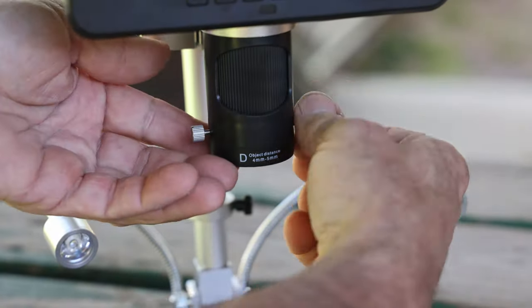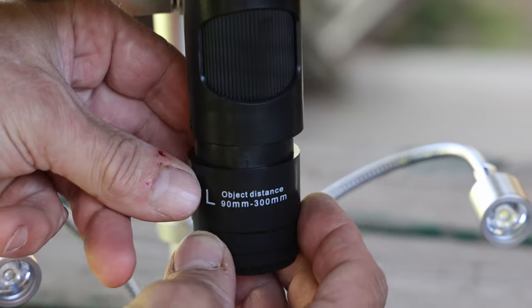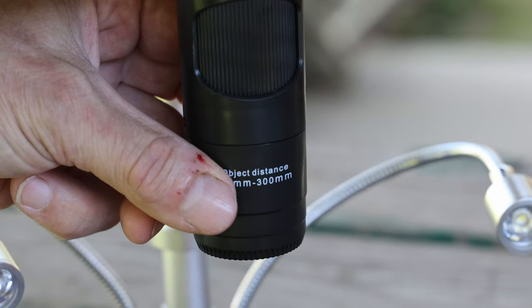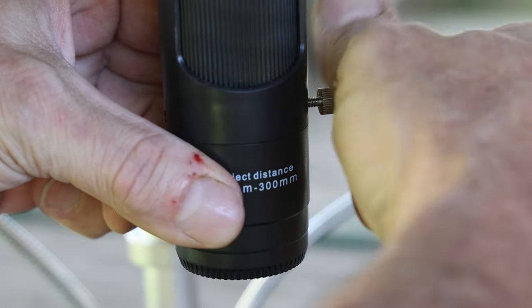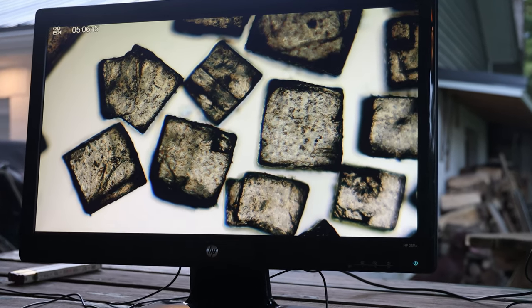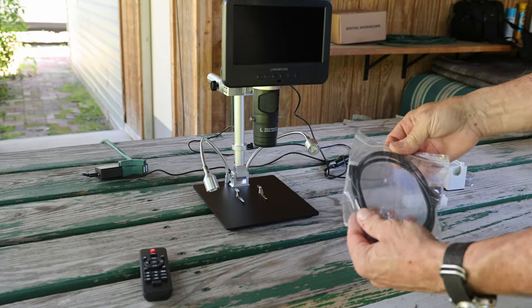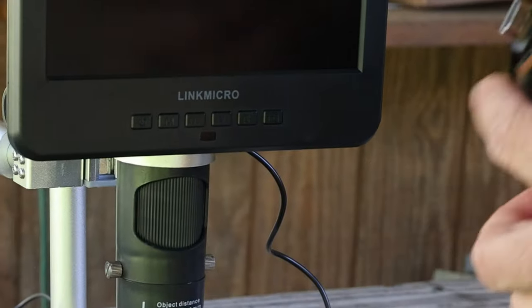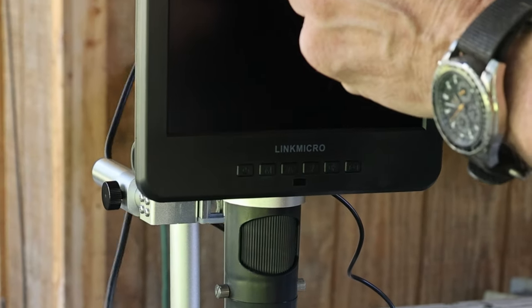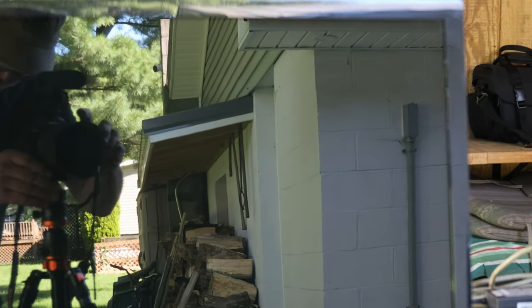To swap out the lenses, just remove the two screws while holding the lens so it doesn't drop. Then carefully put in the lens of your choice with the label facing out. There's a groove for orientation which you'll feel as soon as you slide it in. To take your experience to the next level, you'll need a monitor with an HDMI input or your television. Simply take the included HDMI cable, plug the micro HDMI into the back of your monitor, and connect the other end to your monitor or television.